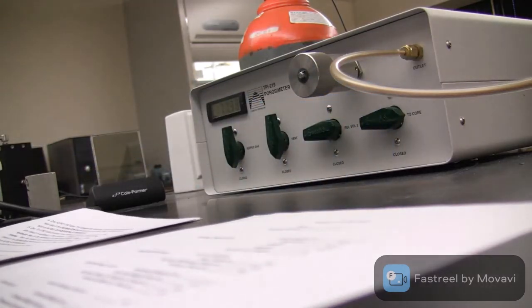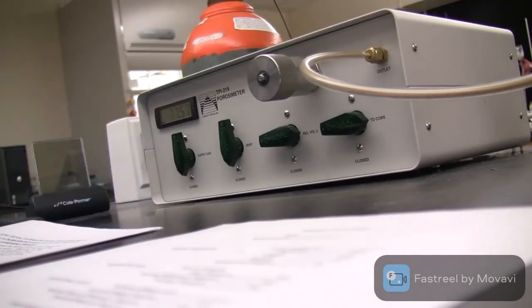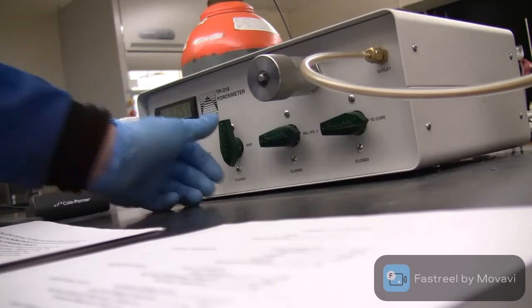So after we do that, you will find that the pressure started decreasing, became like 77.5, and we record that pressure as the full cup pressure. Okay, so we wait until the pressure is constant and then we record it. Now we have finished the first step of our experiment. So we can go and open the vent valve, and then the digital reading will go back to 0.